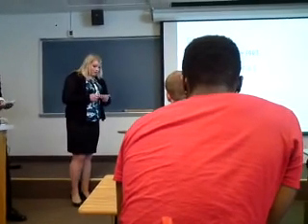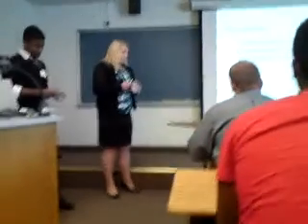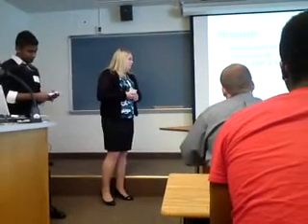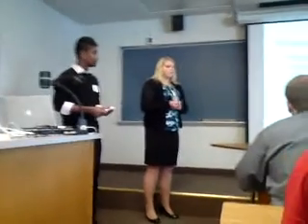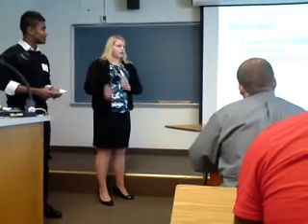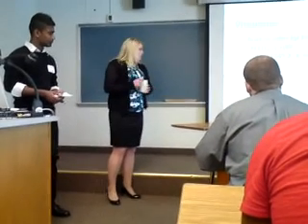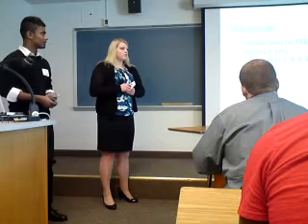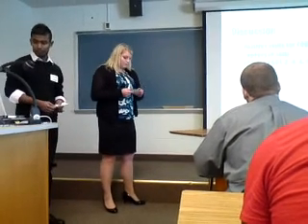Okay, so all in all, we were able to get a positive clone for our FGD3 sequence. Had we had more time to continue working on our experiment, we would have taken the sequence and sent it in to a company, and they can verify if it's correct. This would just be a double check in case what we're seeing is not what we really think it is. Another thing that we would try to do with our FGD3 sequence is express it in cells, and this would allow us to start determining its function.